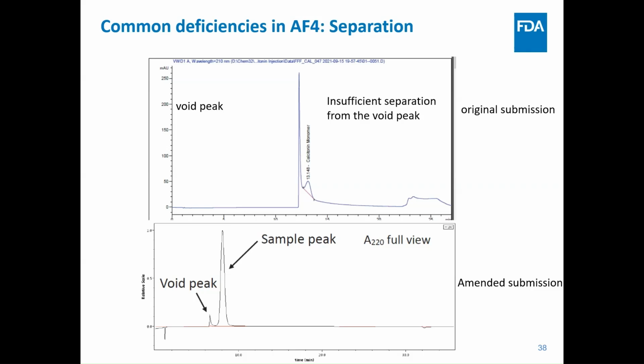And our comment is that your sample peak is not very well separated from the void peak. In that case, it is not a reliable method for the quantification of a high molecular weight aggregate. So we asked them to conduct further development and optimization.